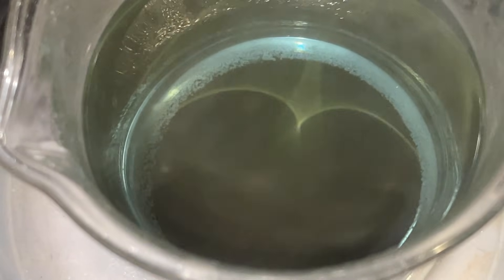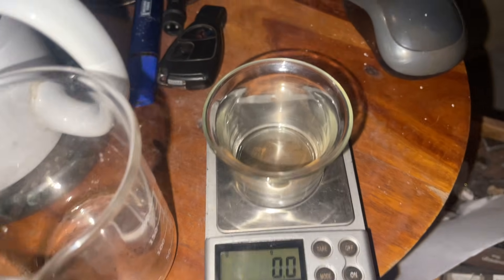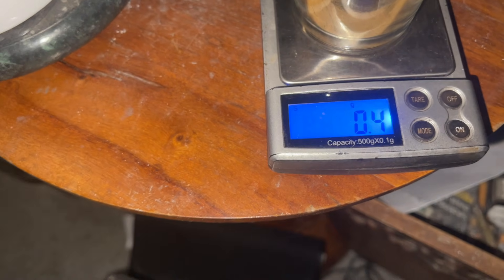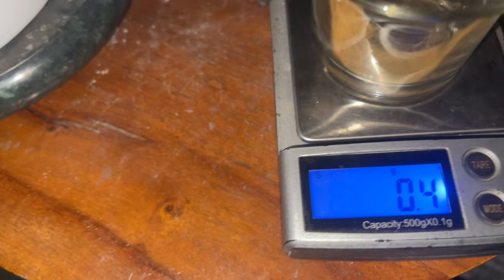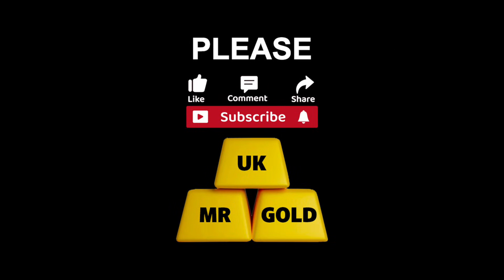We're going to wash that off and get a weight on that. This is the gold from the 600 gram pins — it's not a lot. 0.4 of a gram. It's not a lot at all, but at least it's something.